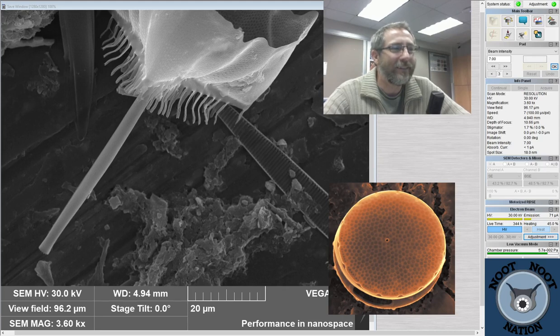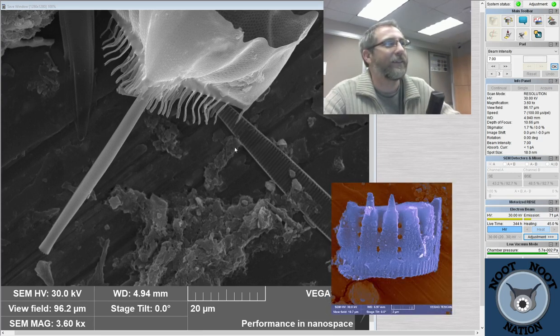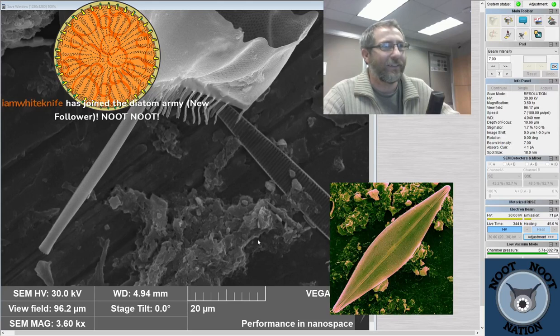But they can, in a few very rare cases, sorry, this is the Ditylum. Oh, I should just call this FS7. And I need to put it in the right folder. Sorry, the mechanics are a little behind. San Francisco Bay. Seven. And this is the Ditylum.